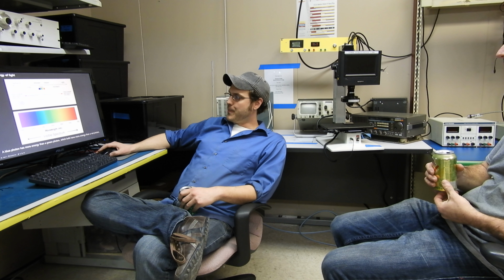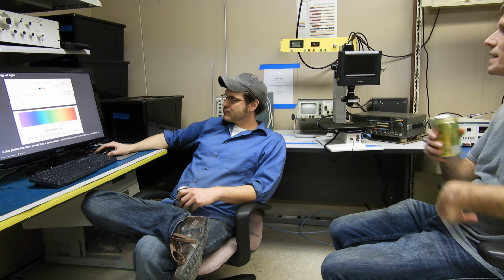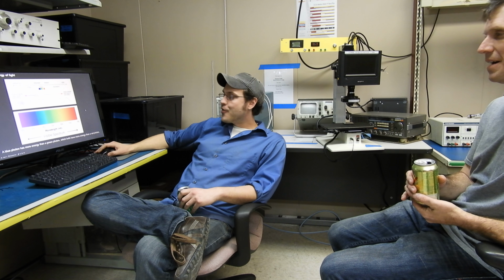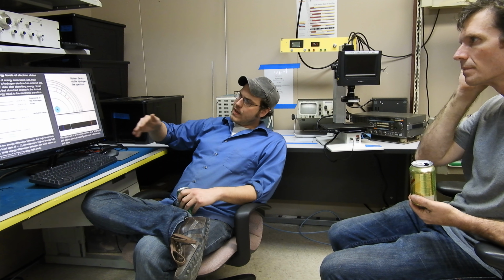Are you familiar with the visible, the infrared, and the UV, ultraviolet? Only because I worked in it subsequently in the industry. Otherwise, I would not have known that after college. But now, 350 to 700, that's about what people see. What you have to do with the net cal is you have to have it hooked in here when you first turn it on.